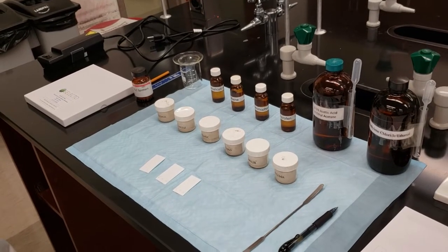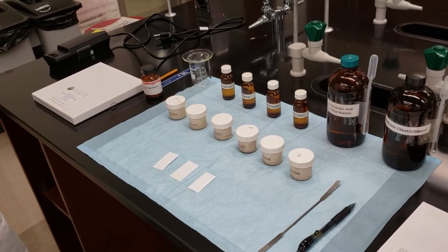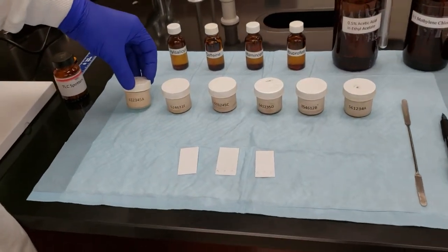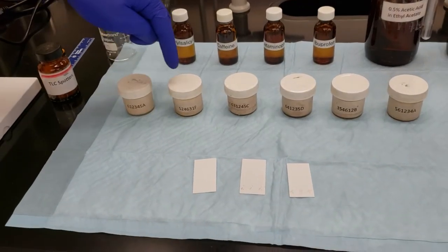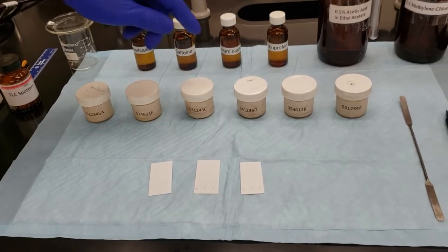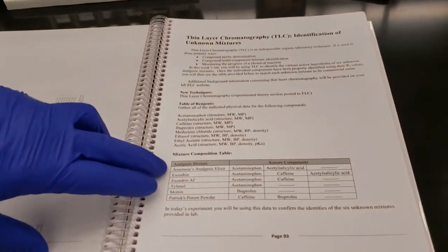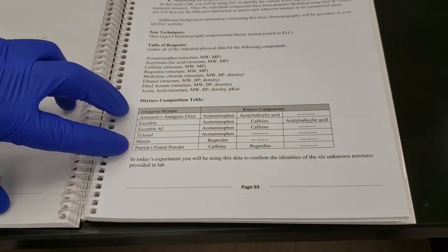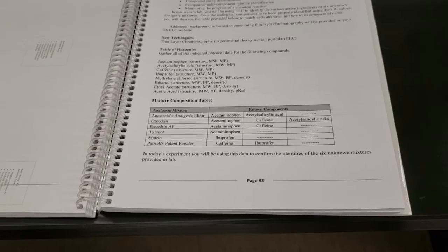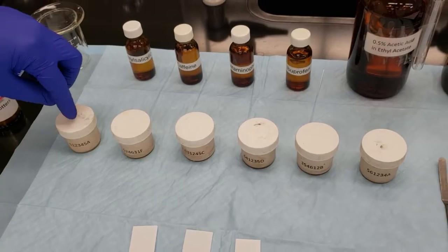CHEM 2211, Thin Layer Chromatography, or TLC, Identification of Unknown Mixtures. So with today's lab, we're going to be taking a number of vials containing our unknown analgesic mixtures. We're going to write these codes down on our data sheet in just a moment, and we're going to pair these unknown code numbers to our analgesic mixture composition table. We want to give each one of those unknown codes its specific and correct identifying name. We're going to do that using both TLC mixtures and spotting mixtures created from these powders.